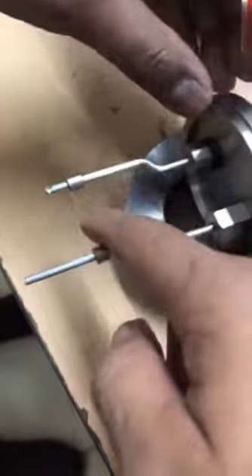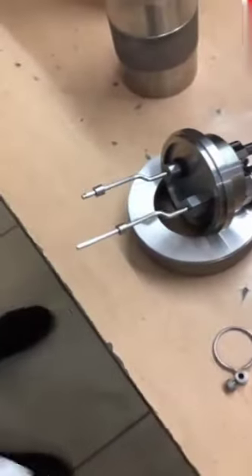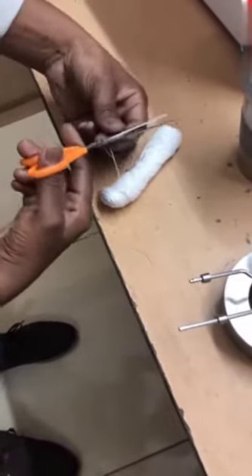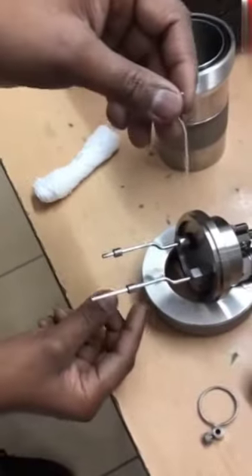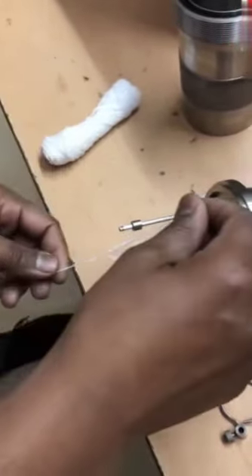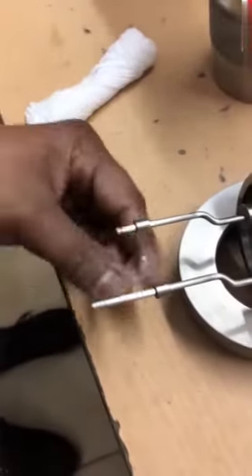Now you can see: if you touch this wire, it is not loose — it should not be loose, actually. So this way we have tied this ignition wire. Now we are taking the cotton thread — we have to take approximately 10 cm. This cotton thread is of pure cotton, having a known calorific value. Tie it in the center, just like this. The knot is tied in the center; you twist from the bottom.